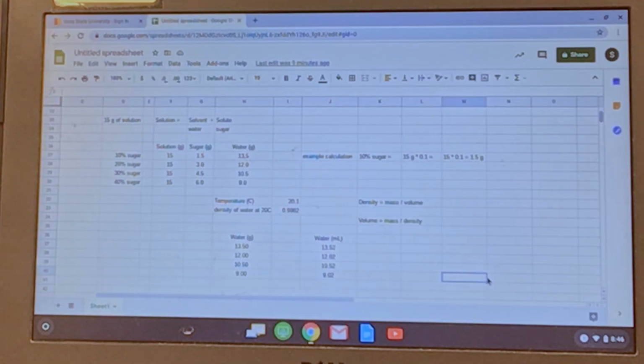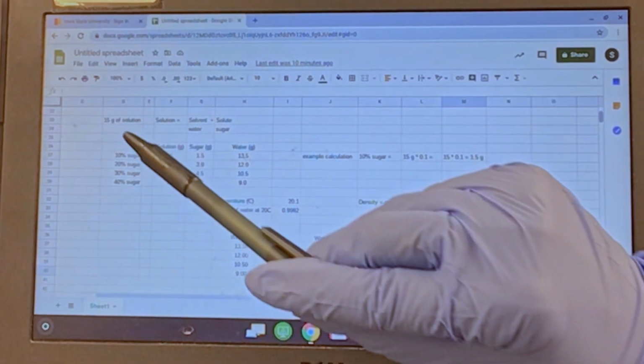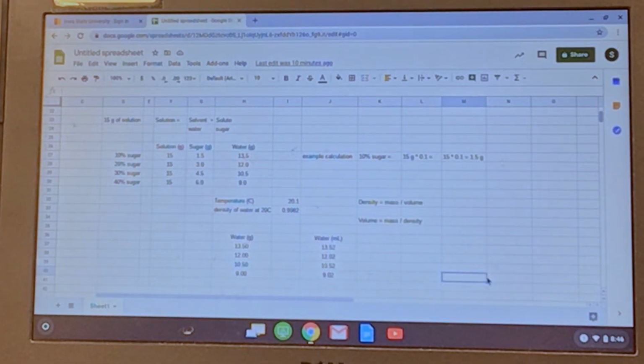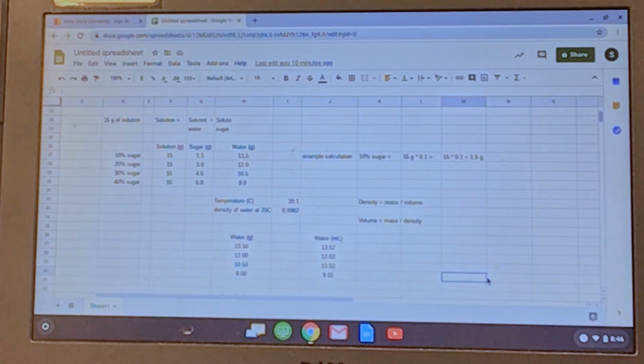Okay, so here I made a few calculations. The lab manual calls for 15 grams of solution. Remember that 15 grams doesn't mean 15 milliliters, because density plays a big role in how much volume corresponds to a certain amount of mass of solution, okay?